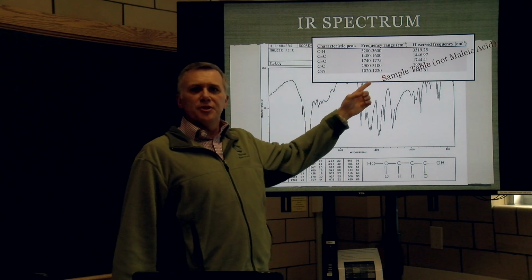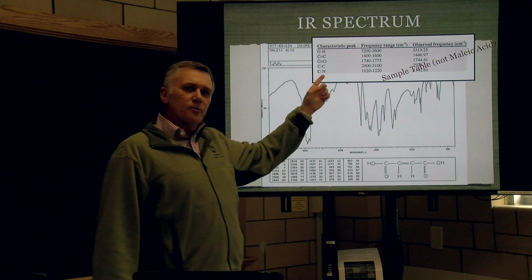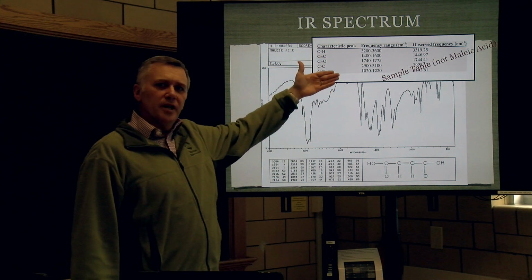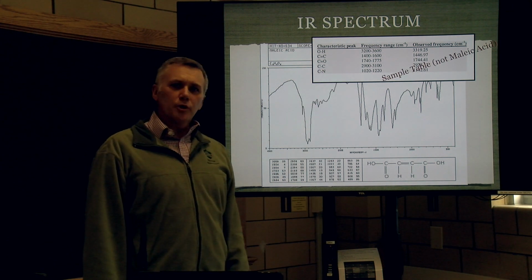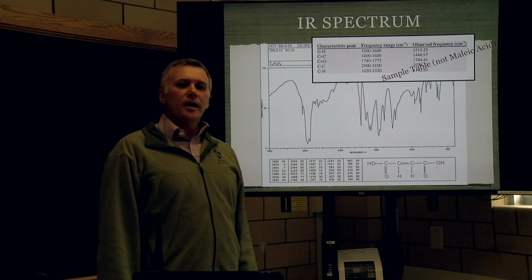Now again, notice this is just a sample data table. It's not from maleic acid, but nonetheless it gives you a sense of how you could take the data here and put it more into table form for your report. All right, so a great way to actually do that.